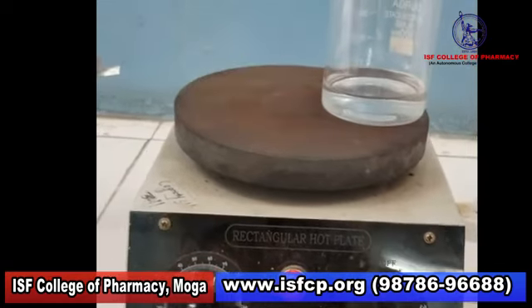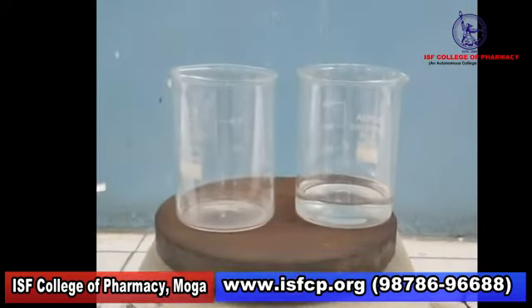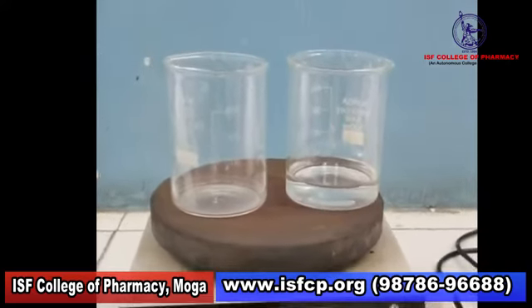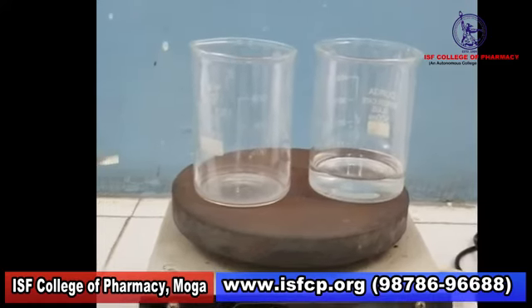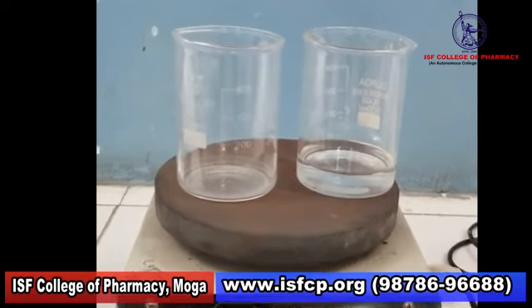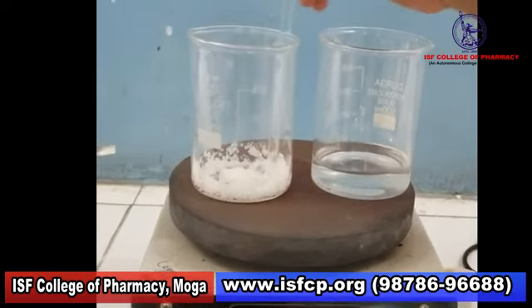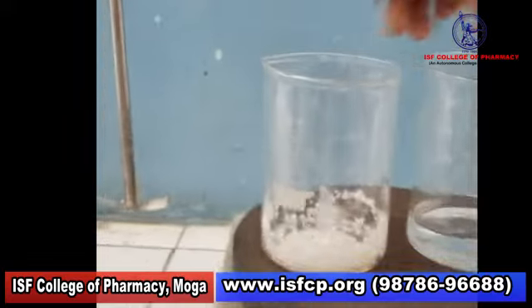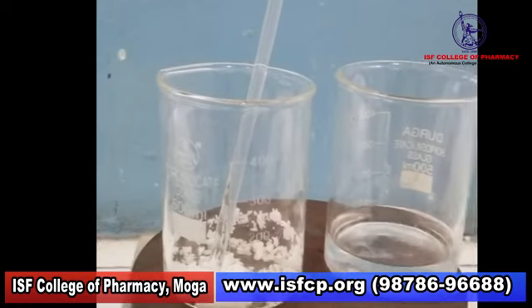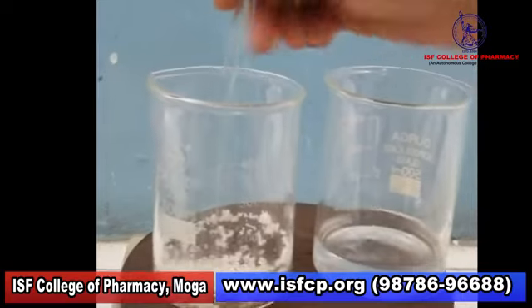For the oil phase, we take a beaker which is perfectly dry, and we take first the ingredient of the oil phase which has the highest melting point. In our case, it is stearic acid. Let us put it into the beaker. It will start melting, and we mix it with the glass rod. After that, we take the ingredient with a melting point less than stearic acid, that is stearyl alcohol, and after that we will put in cetyl alcohol.